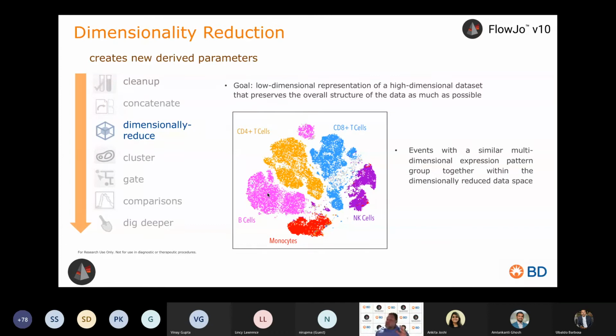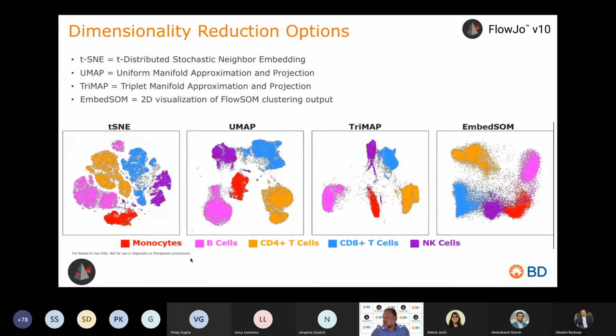And they are all the same lineage, but T-SNE, the way it's seeded, the way it's initialized, it doesn't keep those events that are similar to each other. It doesn't guarantee that they're going to be close to each other within the dimensionally reduced embedding that you get. But it does work very well to flatten the data so that you can use a query gate, so you can explore this data space with a third parameter heat mapping and such.